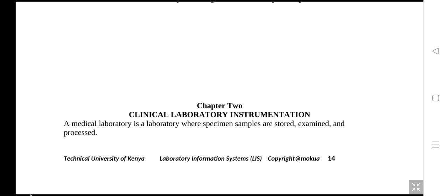So what we're saying is, a medical laboratory is a laboratory where specimen samples are stored, examined, and processed. A number of times you also use the laboratory to extract samples. These samples can come from another facility, but they can also begin with extracting.